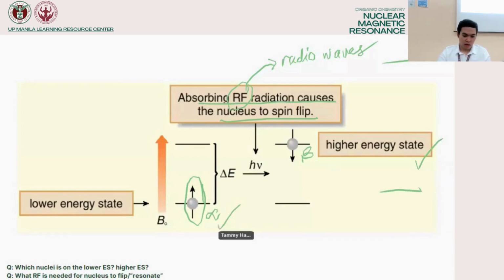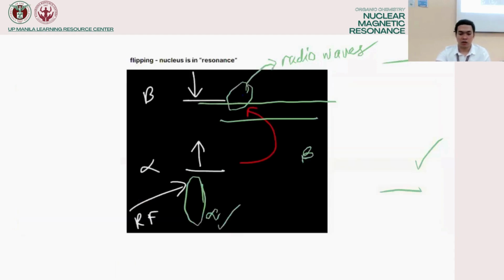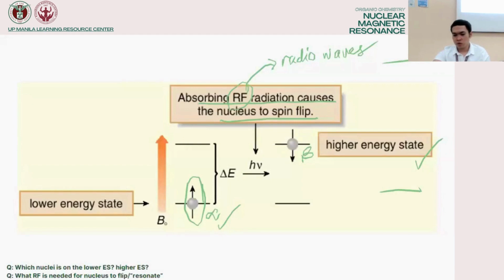No? May question tayo dito. Oh, nasagot na yan, no? What RF is needed for the nucleus to flip or resonate? So later masasagot natin yan kasi hindi po masyadong clear. Okay? So, sige. Yeah, okay. So luckily, different nuclei possess different absorbance to radio waves.